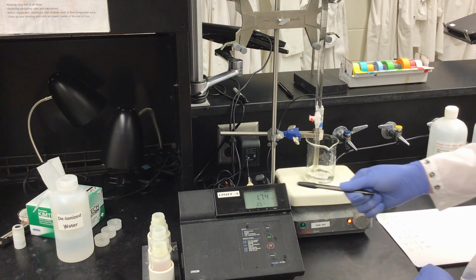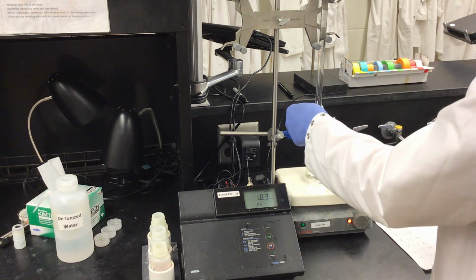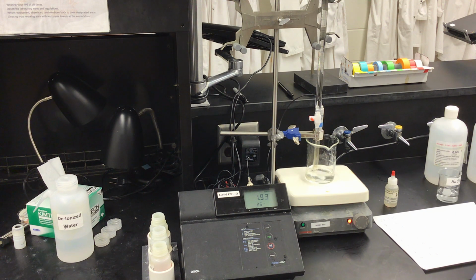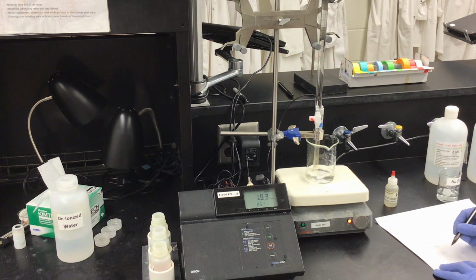At 12 milliliters added, we have a pH of 1.74. At 14 milliliters, we have a pH of 1.83. As you can see, the pink color from our indicator is lasting longer in our solution, which means we are slowly approaching our endpoint. Once we start to see it linger for much longer is when we will slow down significantly and add drop-wise. At 16 milliliters of sodium hydroxide, our pH is 1.93.